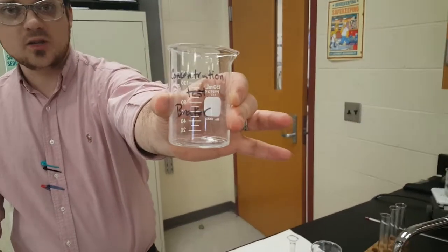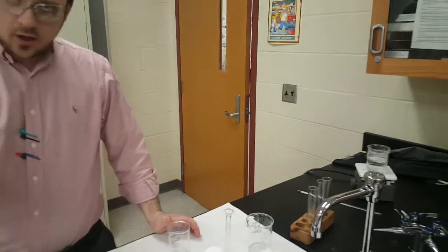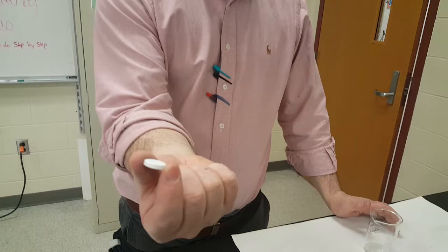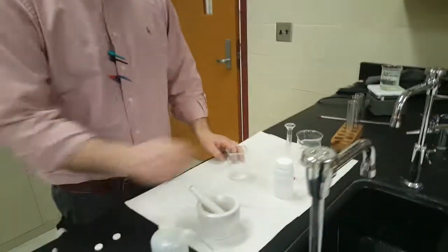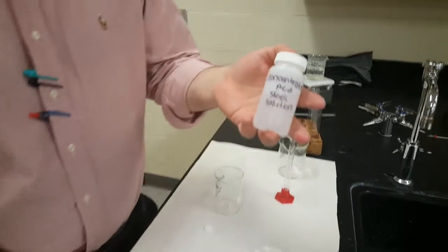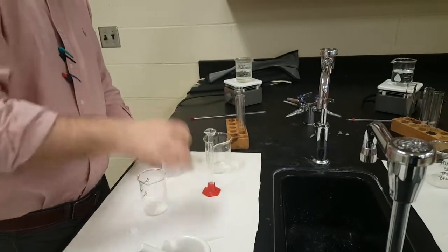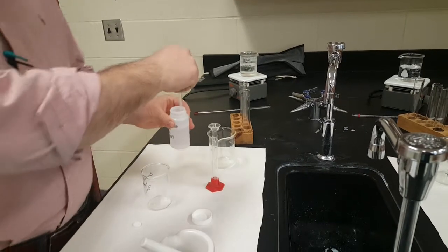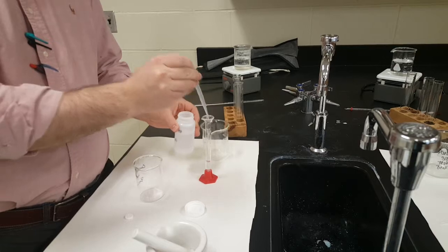So I got a concentration test beaker. I'm going to put it on my table. I got a whole antacid tablet ready to react. Now, I'm going to take 20 mils of my concentrated acid stock solution using the pipette. You got to do this 20 mils.